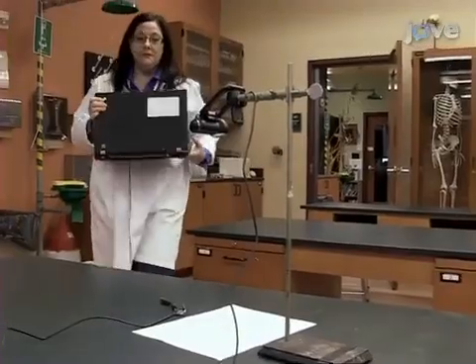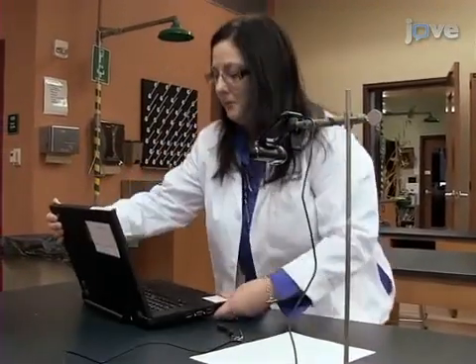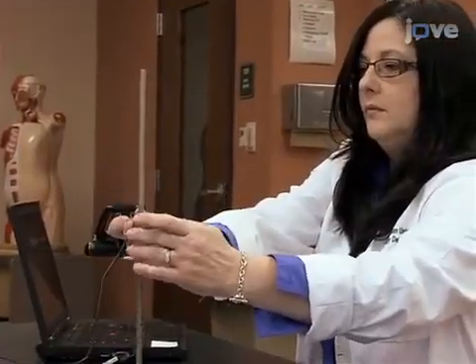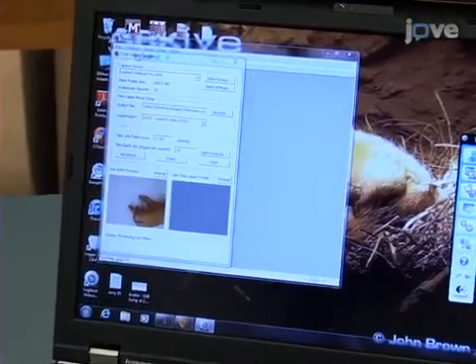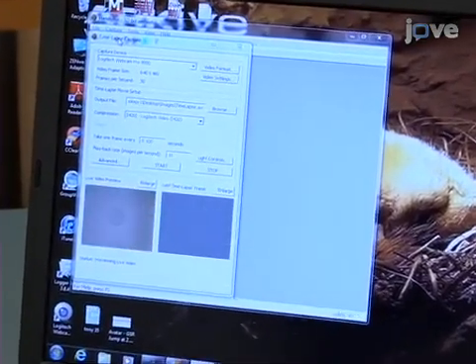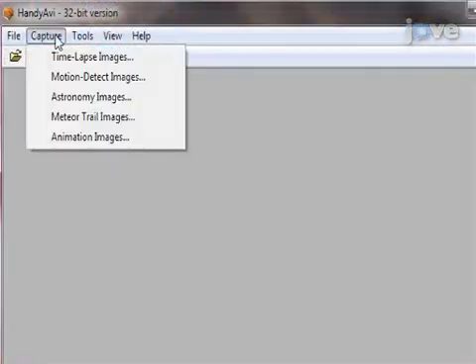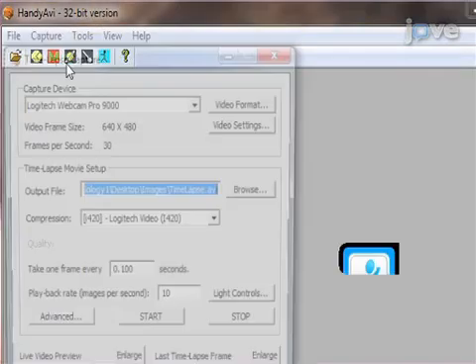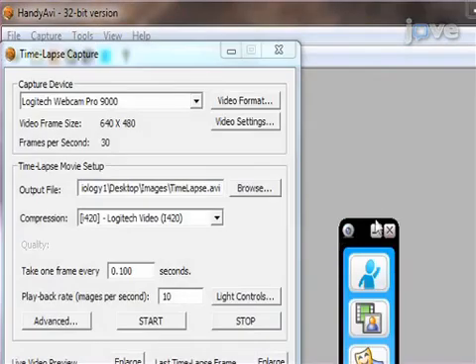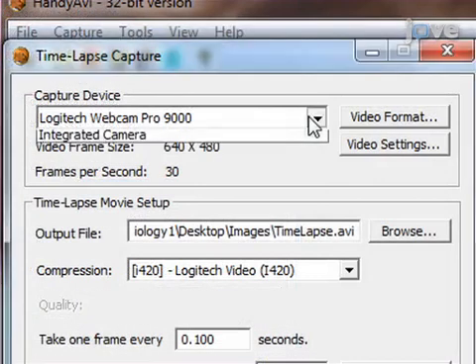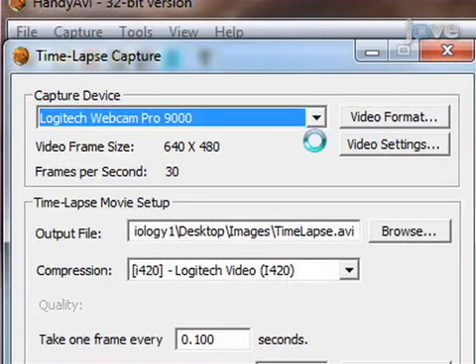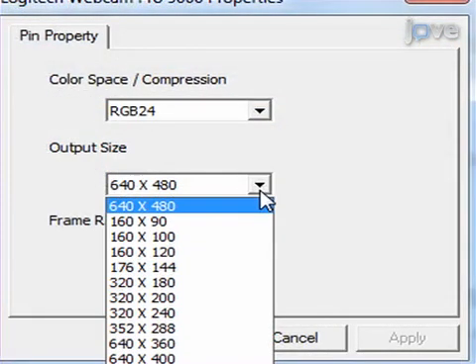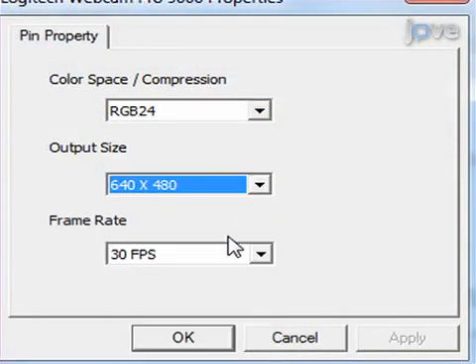To begin, set up the webcam that will record the flies during the locomotor and seizure assays. Once the camera is in place, open the Handy AVI software program to adjust the recording settings. Select the time-lapse images option under the capture tab, and when the new window opens, select the webcam as the capture device. For most experiments, a video frame size of 640 by 480 is adequate.